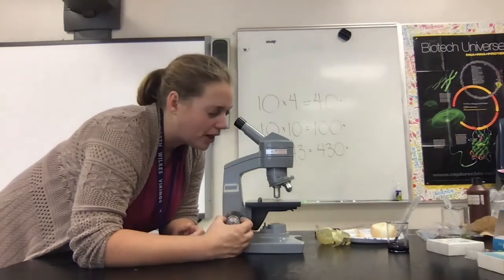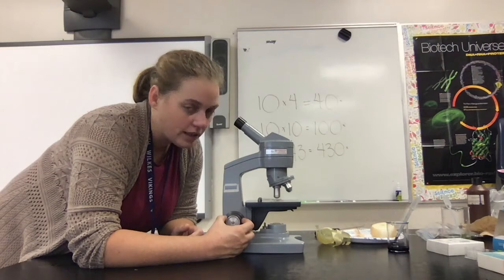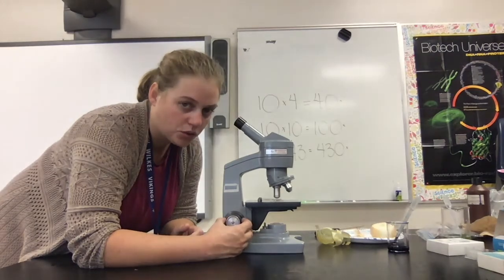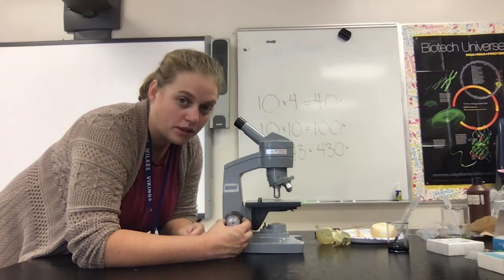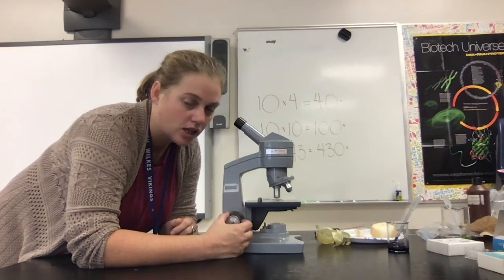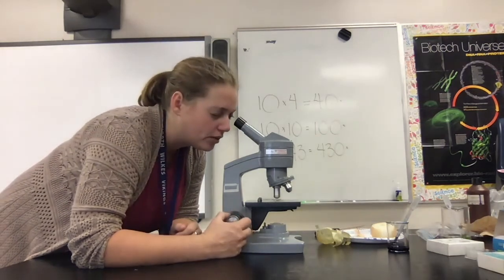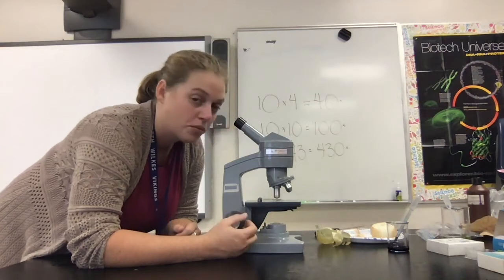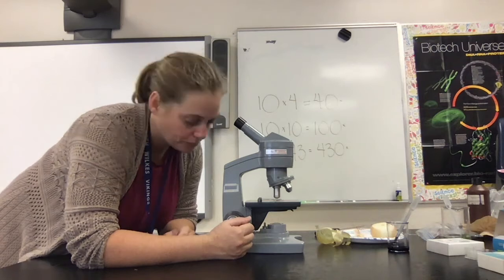And once you're in high power, you want to make sure that you're only using the fine focus knob. Anything else is going to move this objective too quickly for you to be able to focus it. And in certain microscopes, you could also damage the lens because this coarse knob can move the entire objective and you might end up breaking the slide. So on high power, make sure that you're only using the fine focus, and we'll toggle that back and forth to be able to see detail in high power and also to see different layers of that specimen.